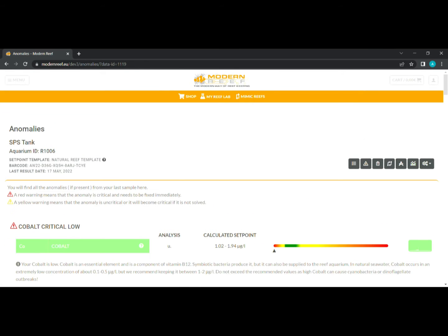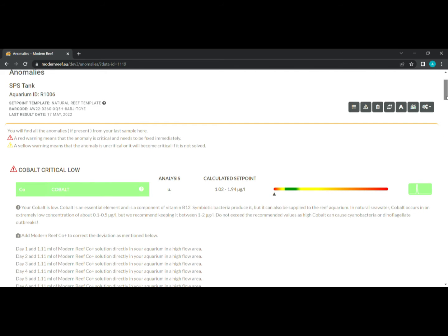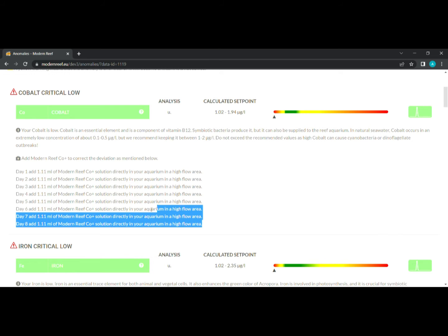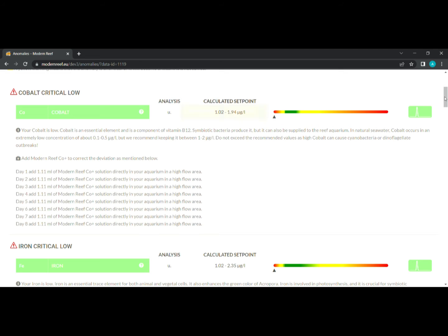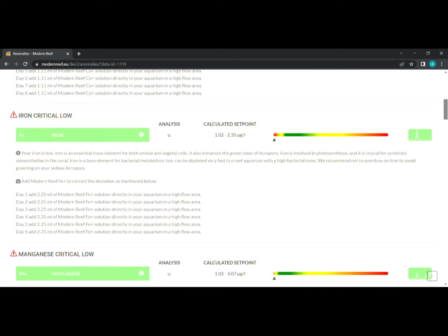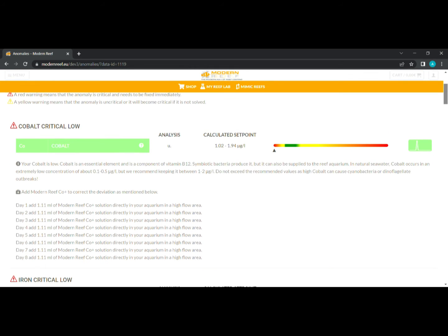Here is where our website will show you what is wrong in your system. Now, what we changed from the previous version is that we had here an add to tasks button. Now we don't need it because we took it out, because this will be added automatically to tasks, because either way the customer will always click on add to task. So we took one click away, to say it that way.